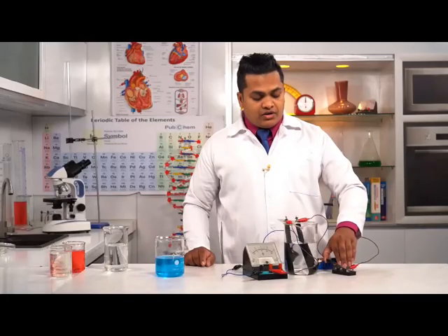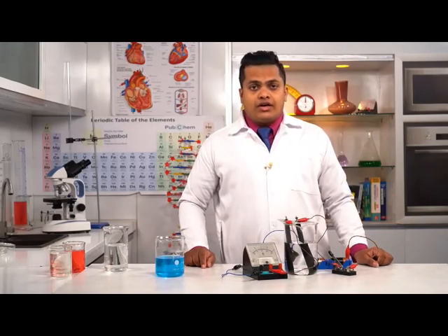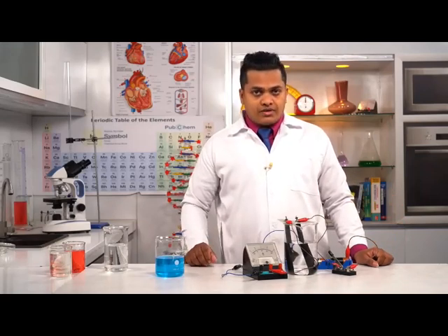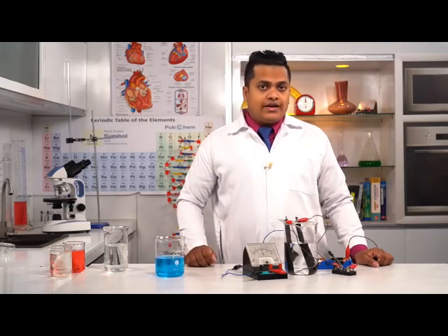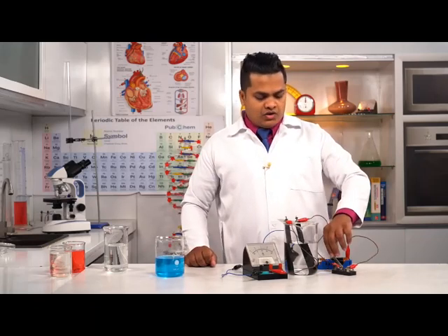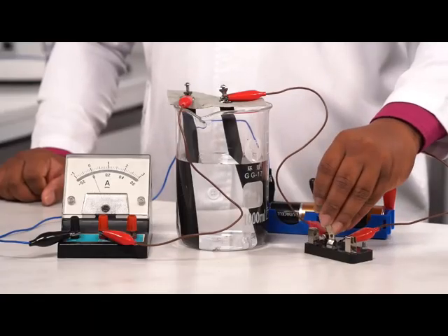So we can come to the conclusion that distilled water cannot conduct electricity. However, you can remember, when we use acidified water, it can conduct electricity. So within distilled water, there is no such observation, right?